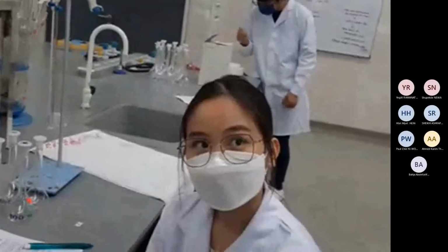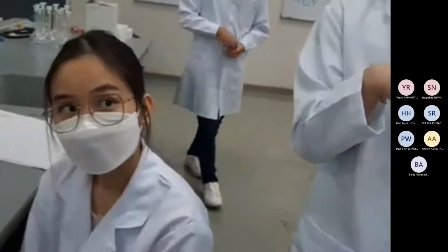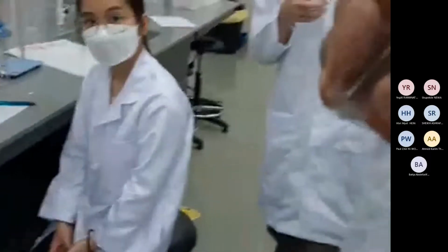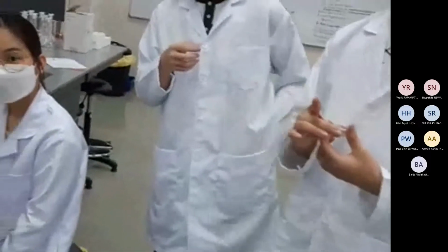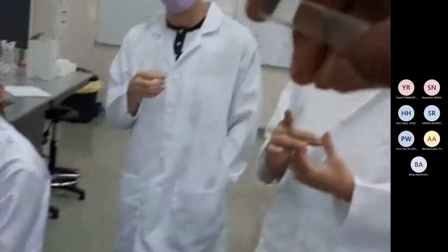Just take a little bit of the solution. You have a lot of solution, you don't have to worry about it. Just take a little bit of it, and then rinse it before you use it. Rinse it means you smear.